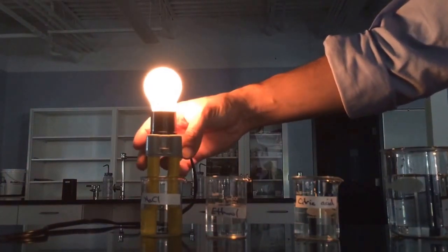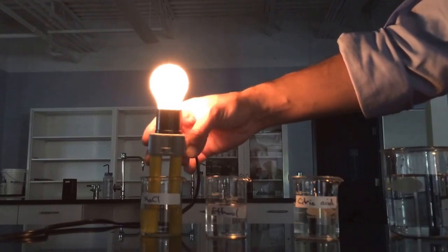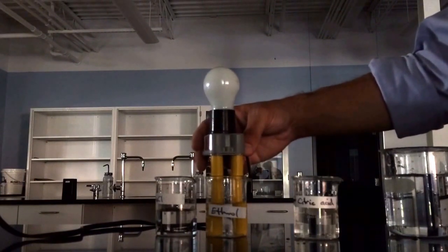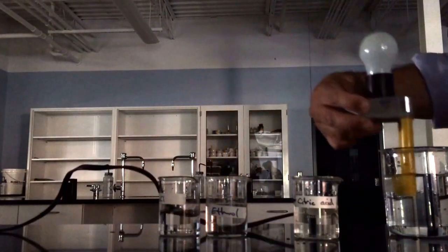The sodium chloride conducts very nicely because there's free ions that are dissociated in the water. I'm going to rinse this guy off. Ethanol, no conductivity because there are no free ions generated when molecular compounds dissolve.